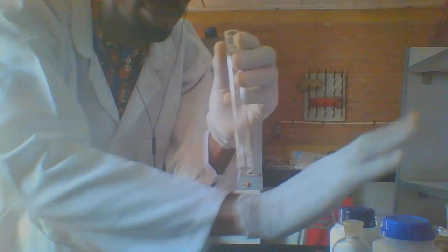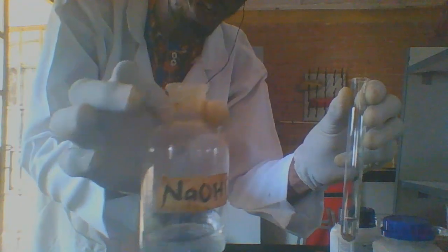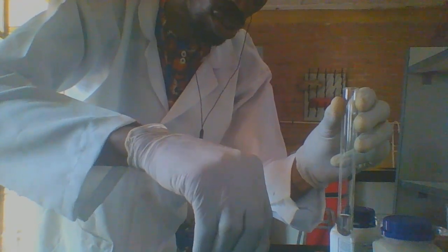So we have kept the residue, although it's still filtering, but this is part of the filtrate. We're going to use it multiple times. Because this filtrate contains lead(II) ion, we use aqueous sodium hydroxide, dilute sodium hydroxide. We add it in drops. Can you see white precipitate forming in drops? It forms and disappears. Now it has persisted. So in drops, we have white precipitate.